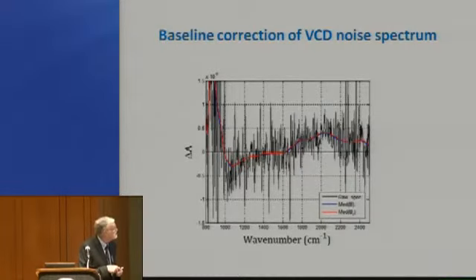Okay. Yeah, if you look at the next spectrum, there's not much difference in the noise here, and there's a little bit. Okay, some of it's water vapor, some of it's a reduction in energy because of water vapor. I think that's what you're saying.